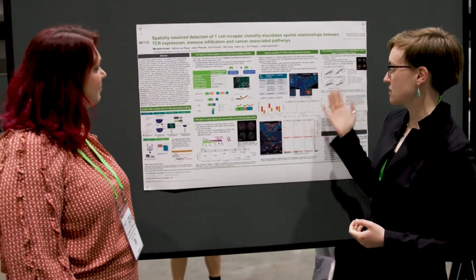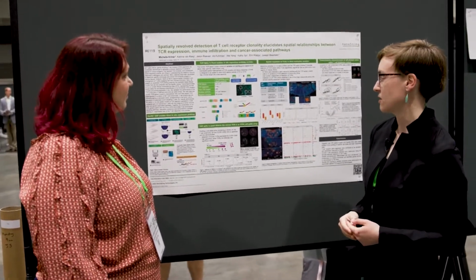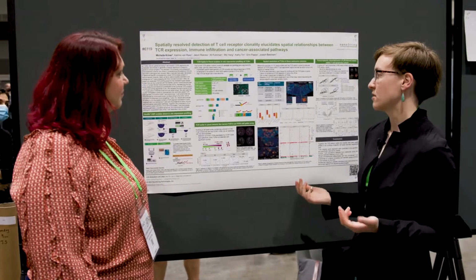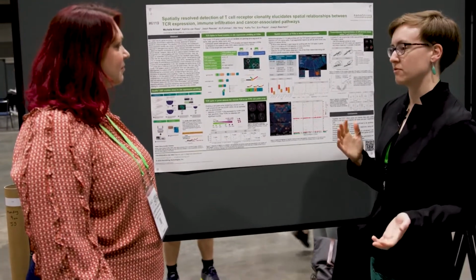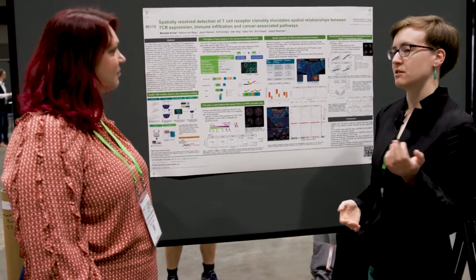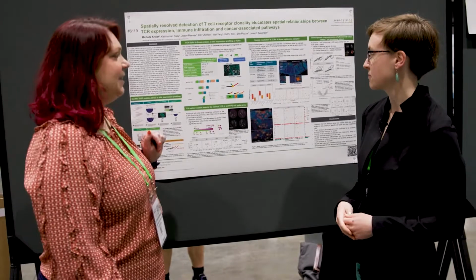So this experiment outlined here was in melanoma. There were 3 melanoma tissues, and they wanted to just broadly profile the TCRs being expressed in these melanomas and see if they saw differences between patients or between different types of regions within the tissues. And what were the findings?